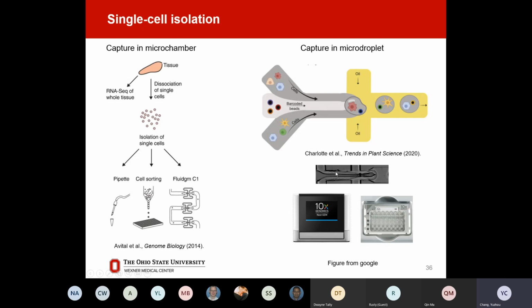And this dynamic motion figure is downloaded from their website. Because remember, we already got this single cell suspension, and we load this single cell suspension into this chip and insert the chip into the 10x machines, and the process will go through. And inside the machines, the microstructure of the working chip is here.